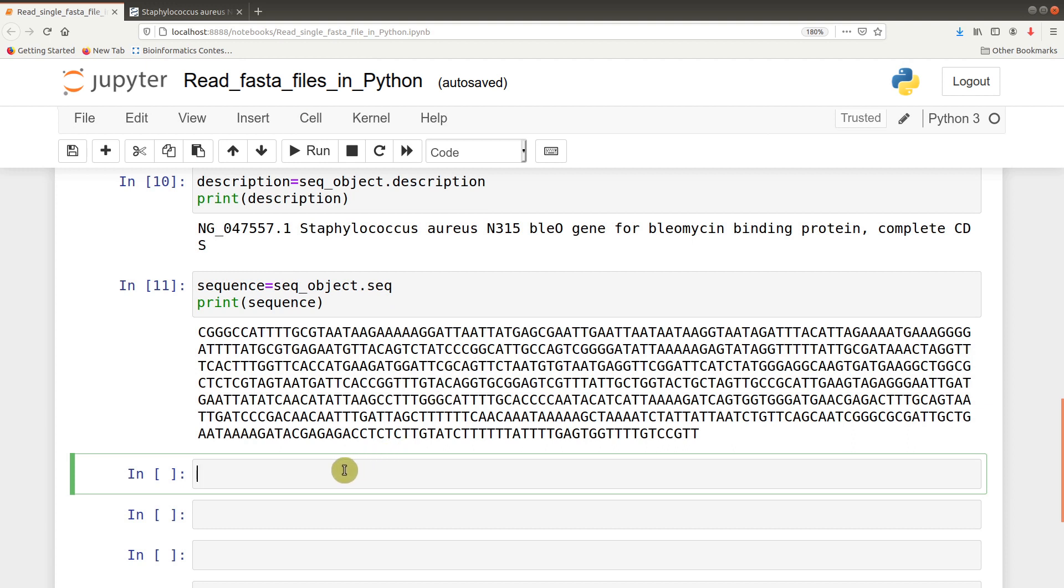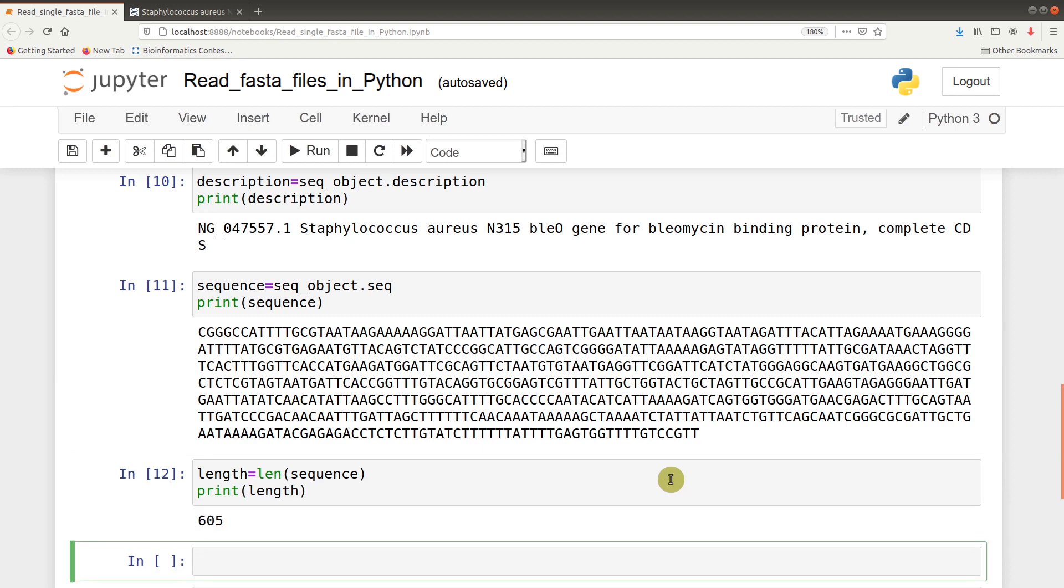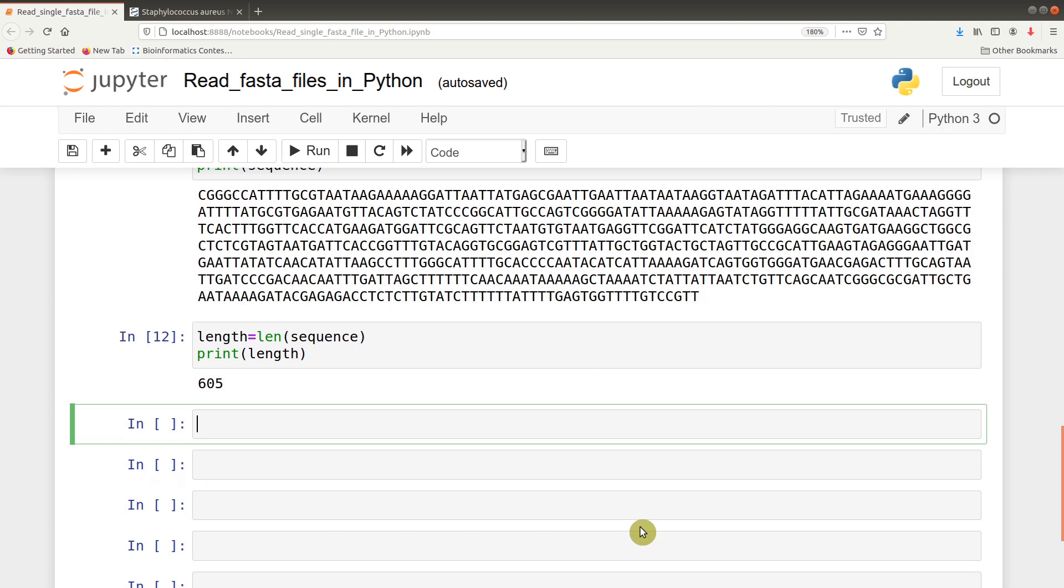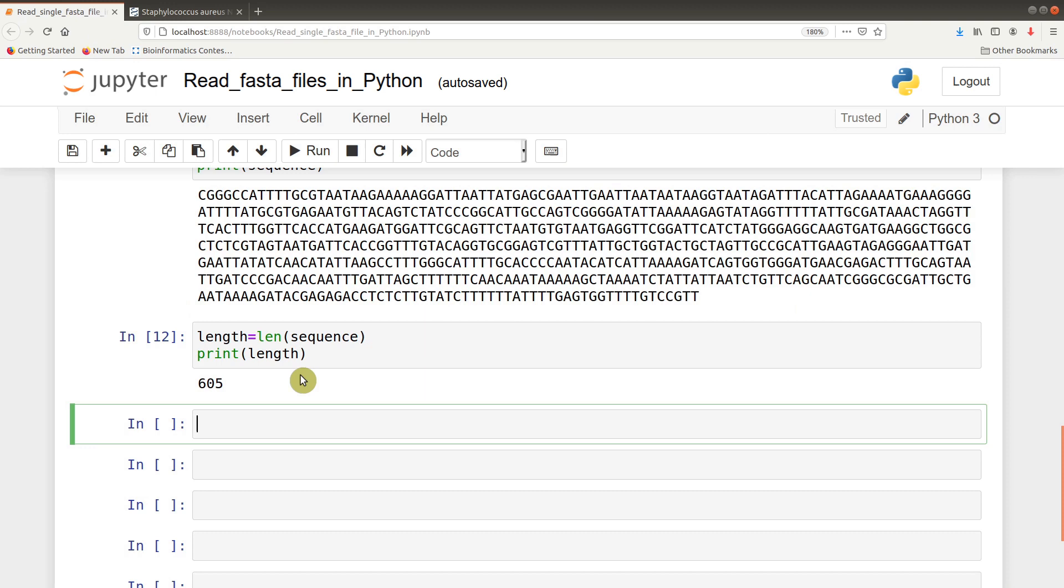From here we can check the number of nucleotides for the sequence. We just say length equals len(sequence) and then we can print it. We have 605 bases or base pairs. Of course you can find that information also here, 605 base pair.